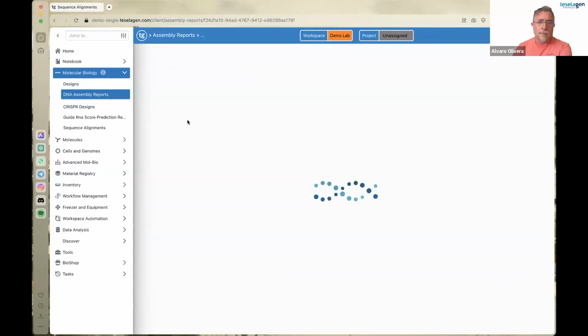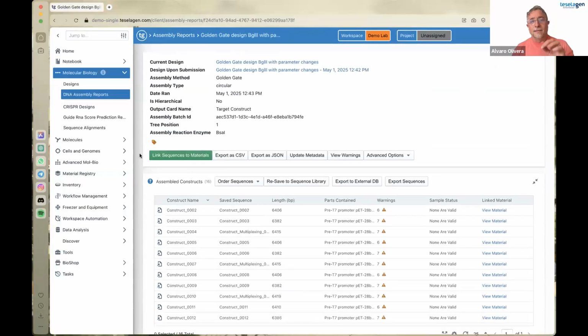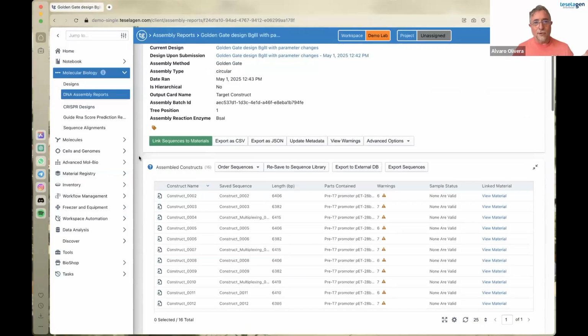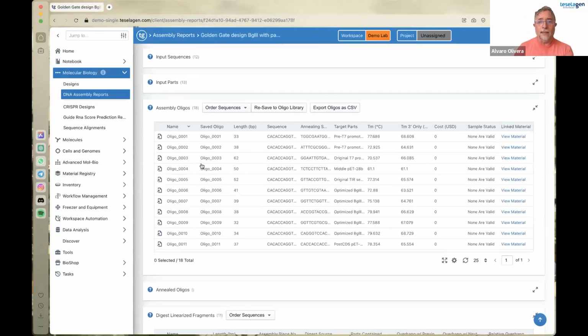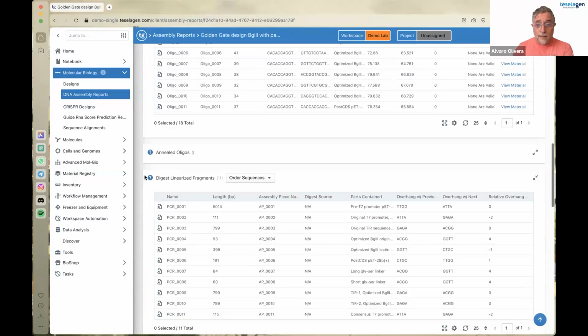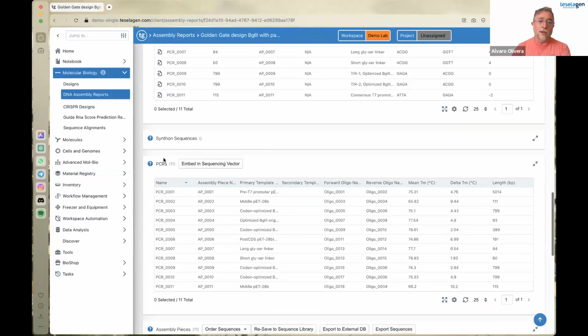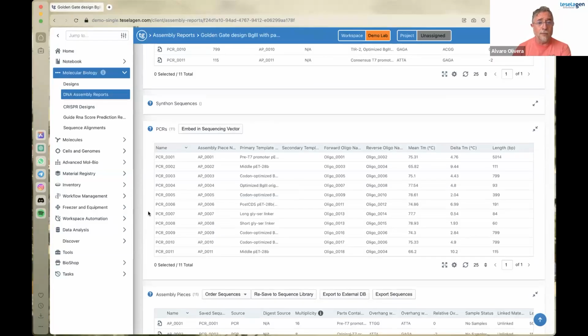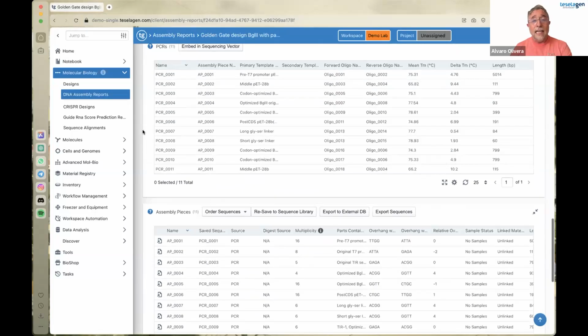So here, as an answer, Teselagen has designed everything for your assembly, including the oligos you will use, and each oligo has overhangs that are introduced when you amplify each part you will use in your assemblies. So you have the oligos, you have the overhangs, you have the PCRs that you have to perform, and at the end you have all the assembly reactions. So everything is performed here.